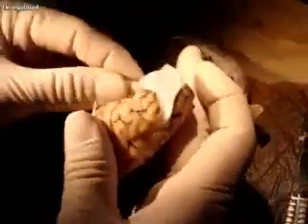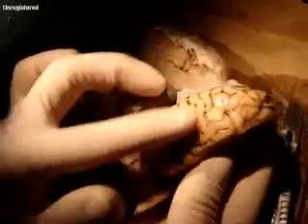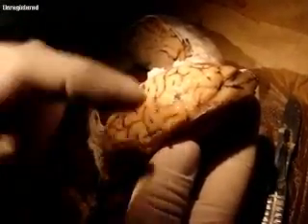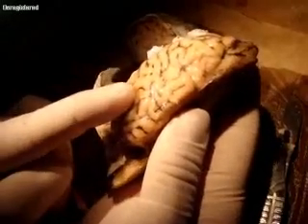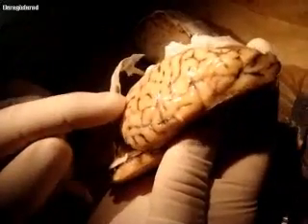All right. So I'm looking at the top of the brain again. I'm looking at one hemisphere now. As I pull this membrane, this very thick membrane back, I'm going to maybe have to cut it again. You can see that underneath it, there are a lot of convolutions on the surface of the brain. And everything that is bumped up, everything that's bumpy, that's called a gyrus. And everything that's going down is called a sulcus. So many bumps are called gyri, and many of these grooves are called sulci.